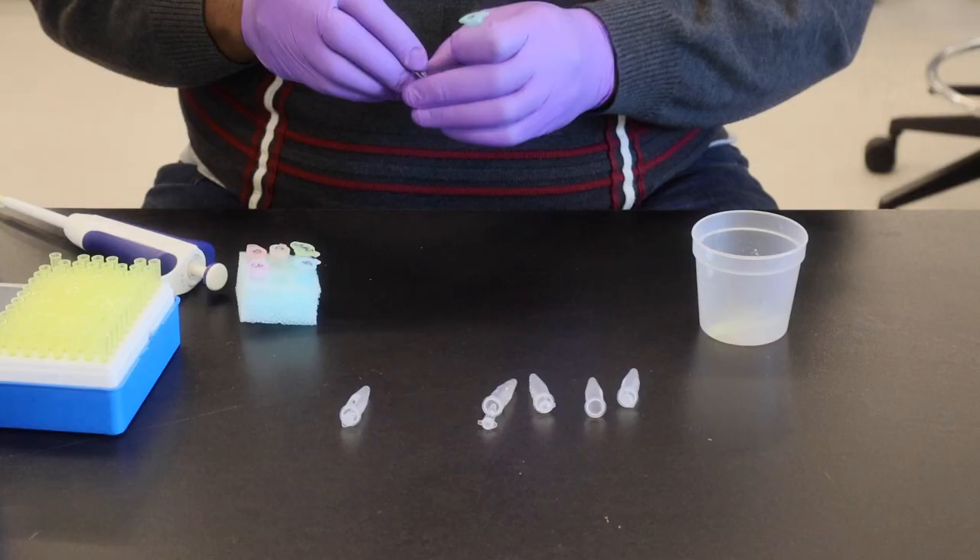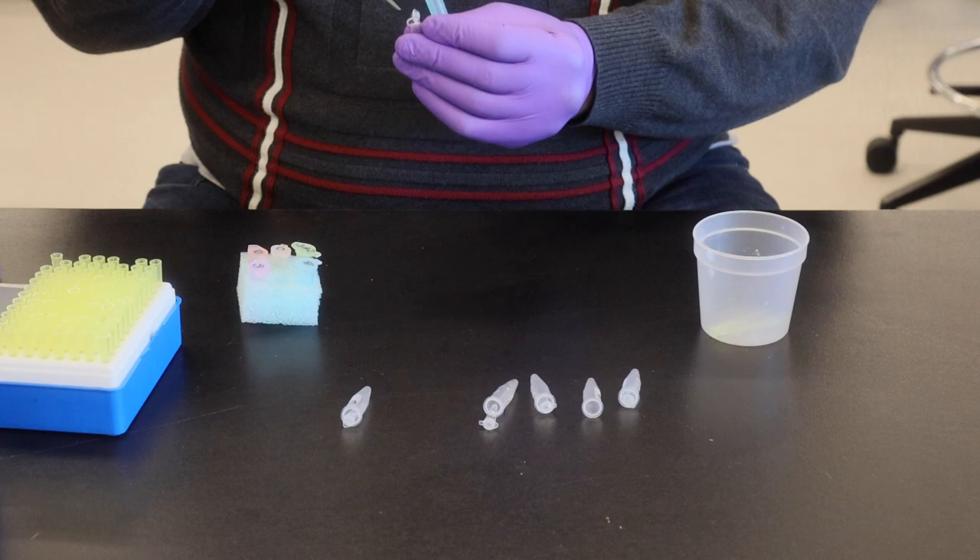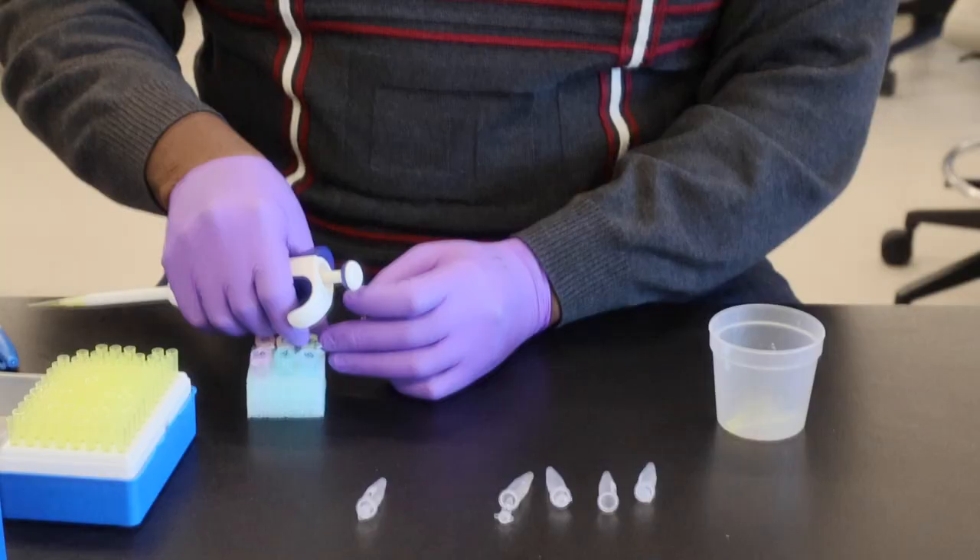We're going to do this with our first standard as well — same thing: 20 microliters of DNA and 20 microliters of our master mix plus primer. Pipette that up and down a bit.